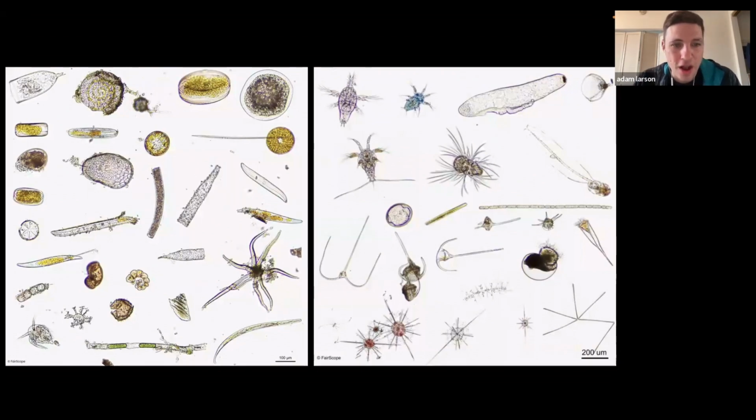And so you get all these giant data sets filled with all your different objects, so all your different plankton objects. And then you can do with this what you want, right? So you can then upload this to Ecotaxa and get those species level confirmations from these experts. Or you can do whatever you want with these images, in addition to making these very beautiful collages that you can look at, which get a really good view of what is in this water that you're interested in.